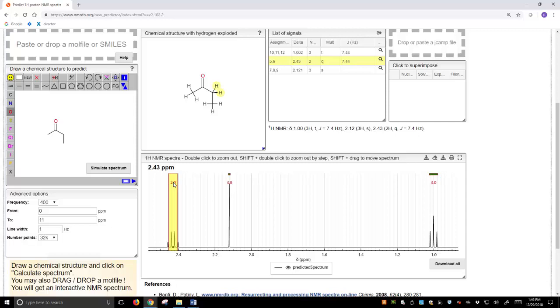So we'll use this particular website in a number of the videos that we're going to view about NMR spectroscopy, and I would encourage you to go on this website and poke around. It's a great way to explore and think, what would happen if I put a chlorine on that molecule? What happens to the chemical shift? And you can see all these with this prediction tool.